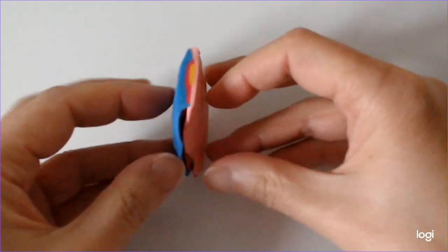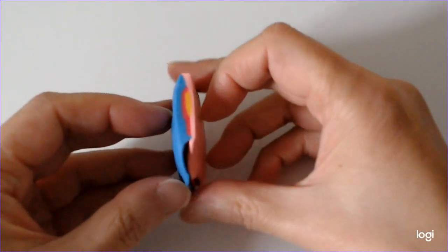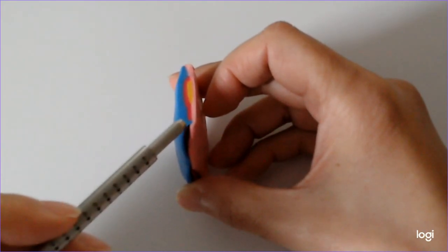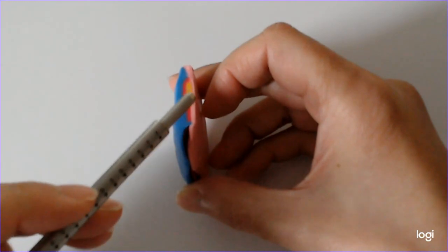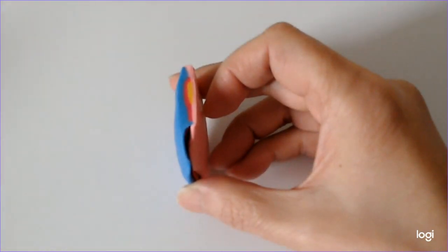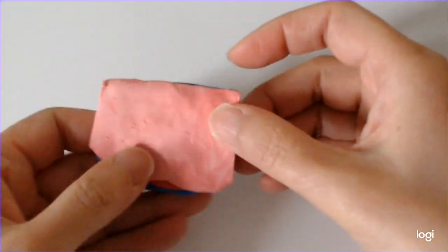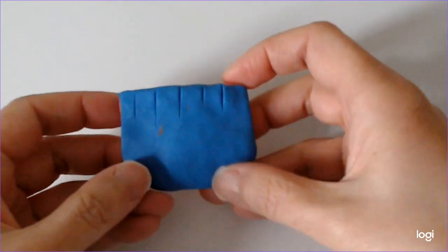If we look at the specimen edge on in a sagittal orientation, we can see that there is skin anteriorly, then subcutaneous tissue, then tarsal plate, which I've made yellow, and then the conjunctiva. As the skin and conjunctiva are both surfaces, these aren't surgical margins that we need to worry about.